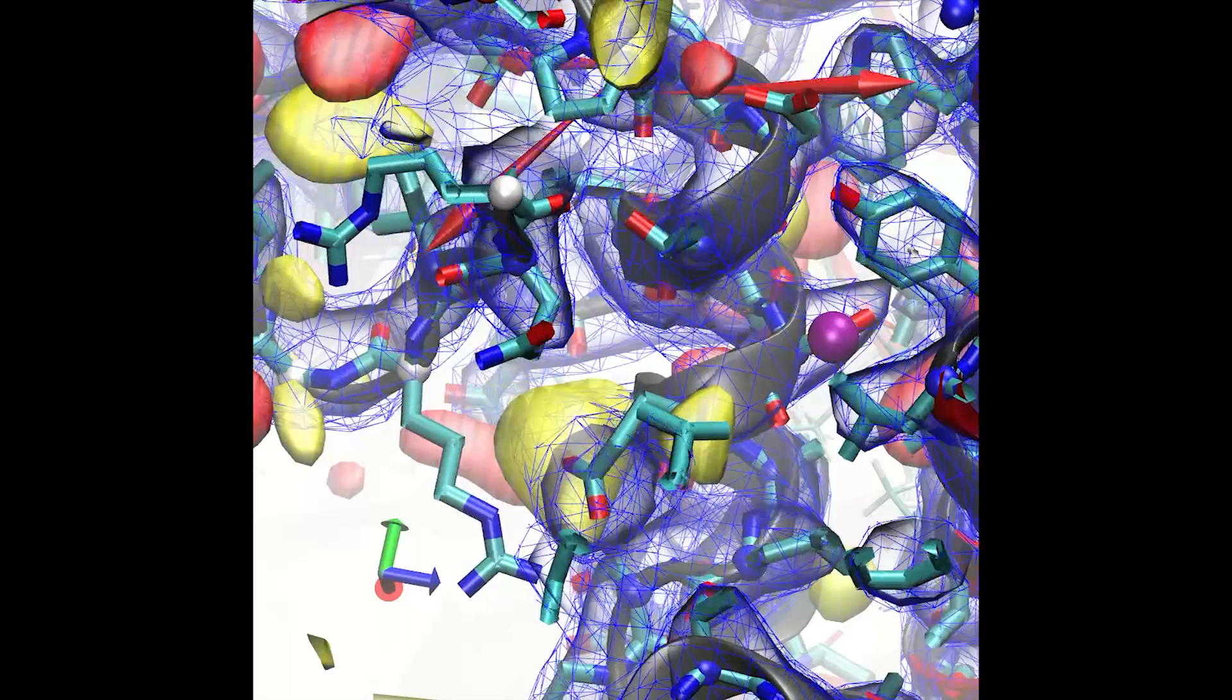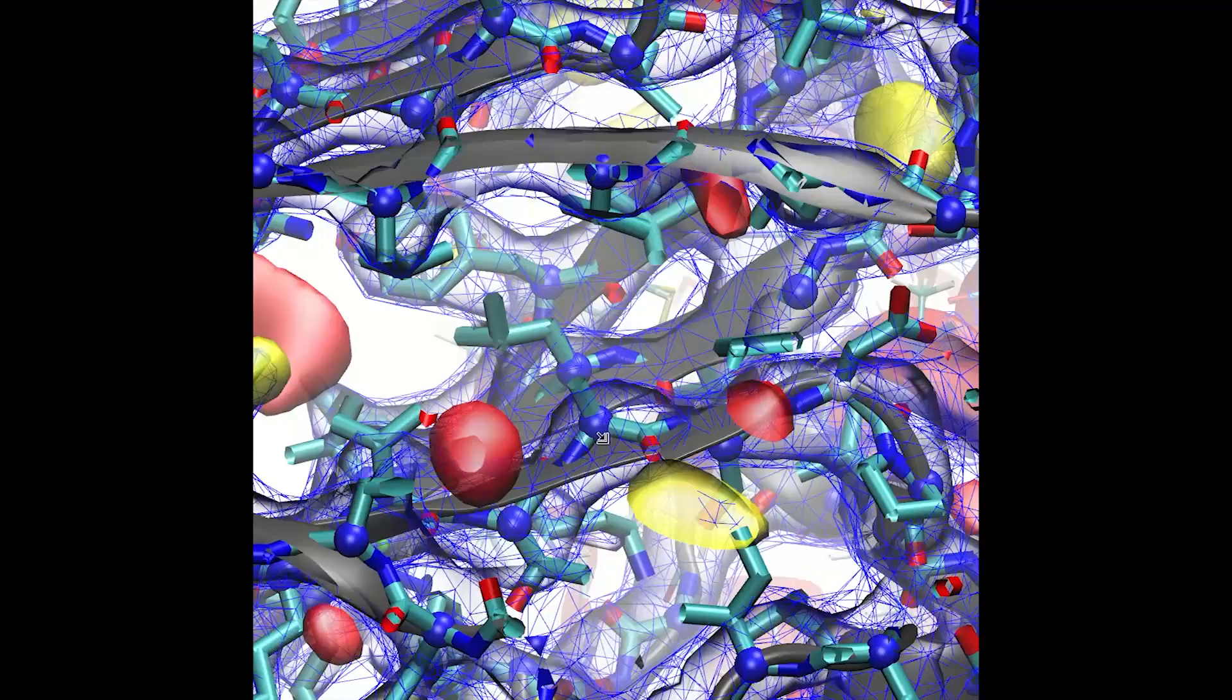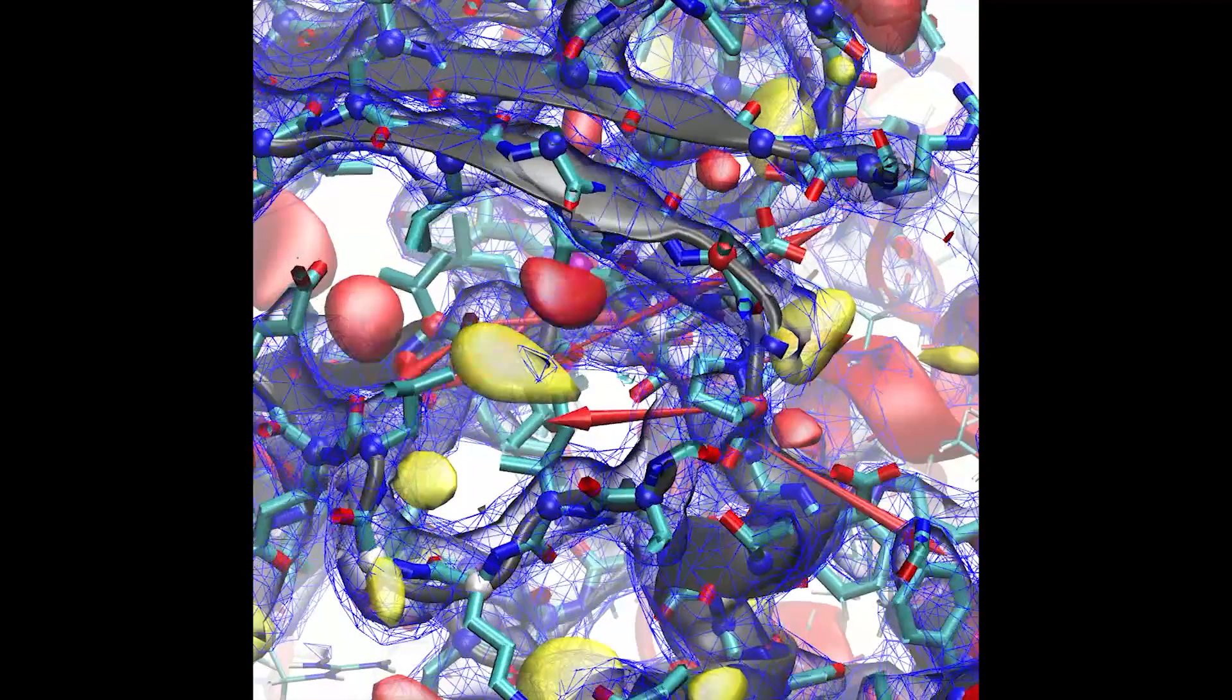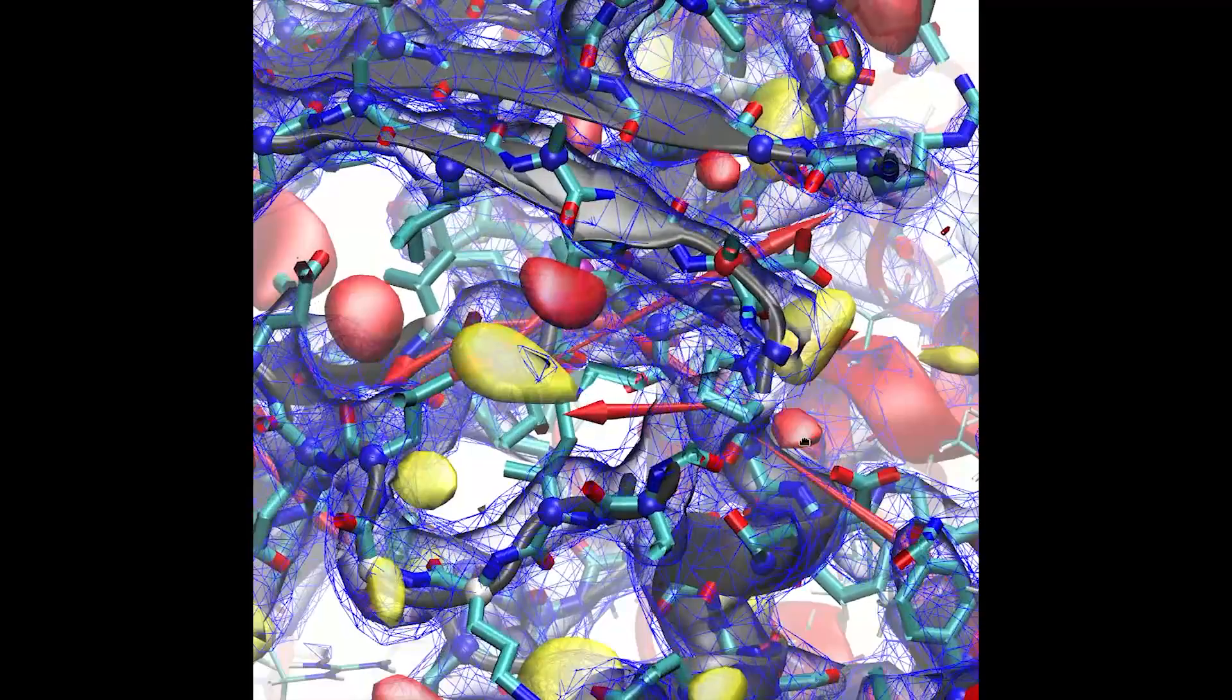Next I'm going to select an atom from the adjacent beta strand and ask the simulation to move the whole strand two residues towards the C terminus. The extent of the strand is automatically detected, and biasing forces are added to the C alpha and beta atoms to guide them towards their target.